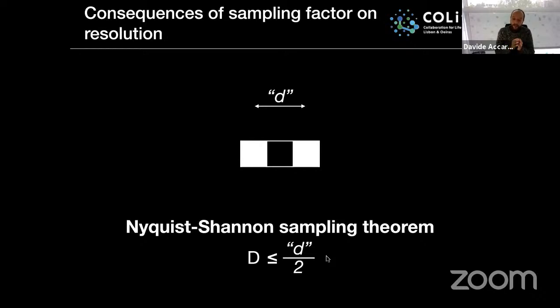So if you are looking at really big structures, for example mammalian cells, and you are interested in counting cells, you don't need to respect the 250 nanometer optical resolution of your lens, but you might go into the order of microns resolution. So always consider tuning your microscopy parameters and acquisition parameters in function of your scientific needs and not in function of the maximum best possible, okay? This is not the only consideration regarding the sampling principle.